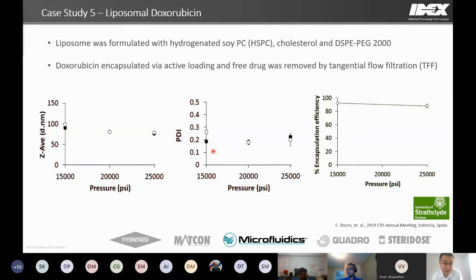If you have a single particle size, you will end up with a PDI of 0, so there's no variation. If it's a truly heterogeneous distribution, the PDI will equal 1. So PDI will be between 0 and 1. Most people, especially in the pharmaceutical industry, would consider a PDI below 0.2 to mean a homogeneous particle size distribution.